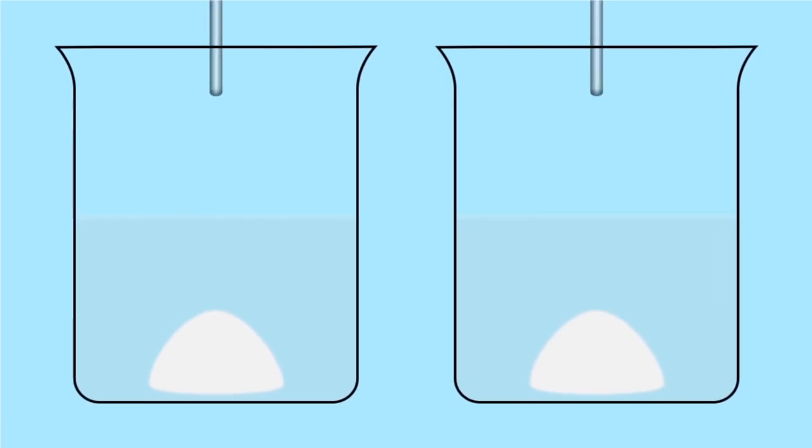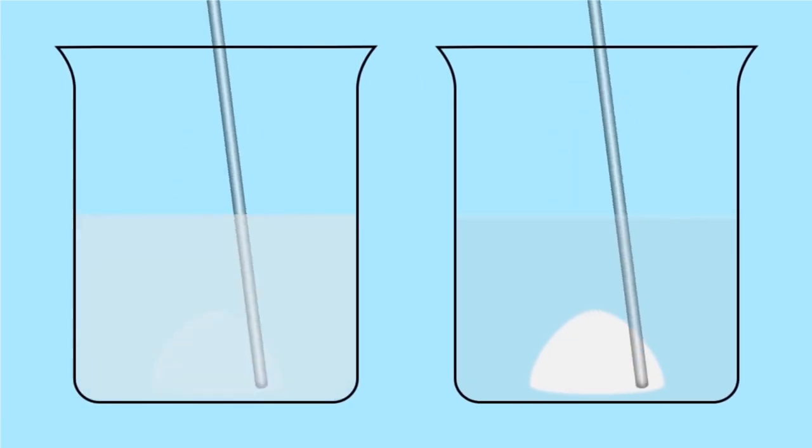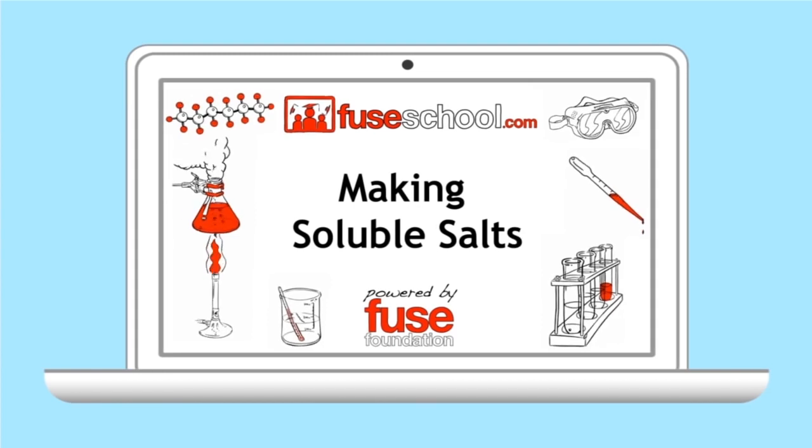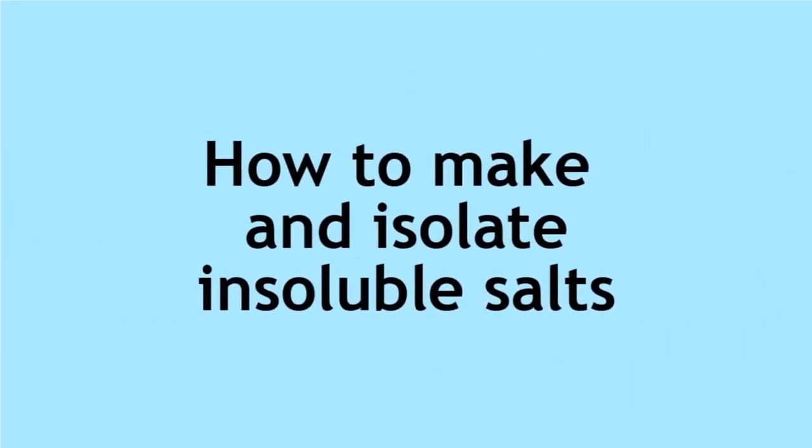Some salts are soluble in water, whereas some are insoluble. In a previous lesson, we learned how to make and isolate soluble salts. In this lesson, we will learn how to make and isolate insoluble salts.